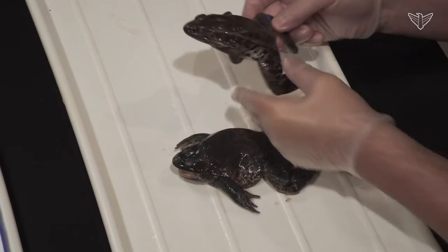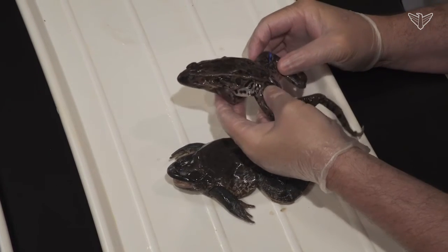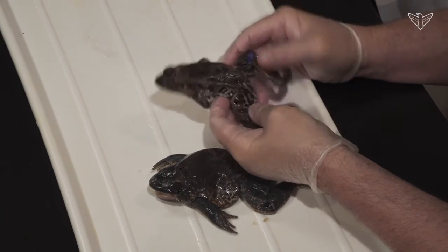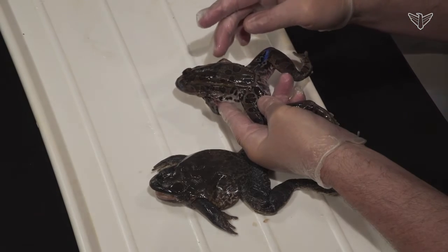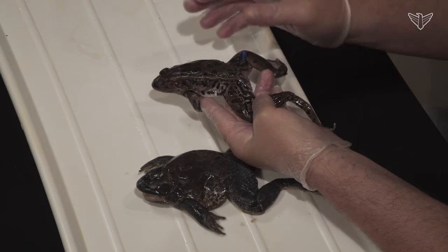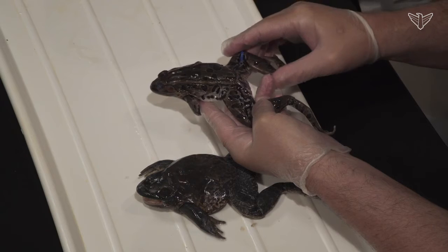So we did need to discuss the difference between our two kinds of frogs, which are commonly available from biological supply houses. This is probably the workhorse of biology, the one that most people use. They're a little bit smaller. They're the northern leopard frog, sometimes called grass frogs. Rana pipiens is their scientific name, and you can see they call them leopard frogs because they've got these dots on them. They're much more green when you see them living, without being preserved.